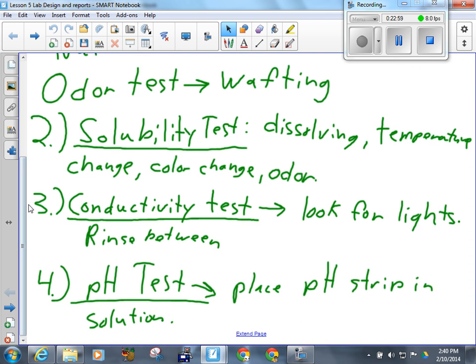The last test you're going to do is the pH test. You'll have little containers of pH paper. They're different shapes and sizes, but they're generally like this, and they'll have a color chart inside that tells you what color corresponds to what pH. So you take just a tiny piece off. You don't need very much. Let's say maybe about this much, half an inch maybe.